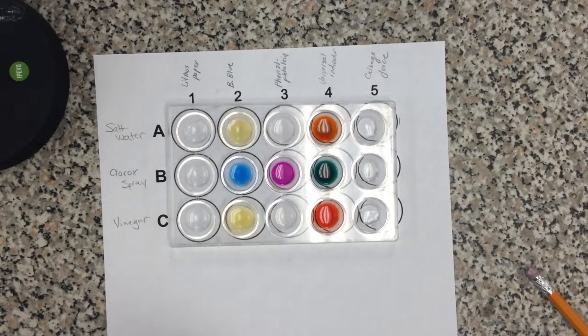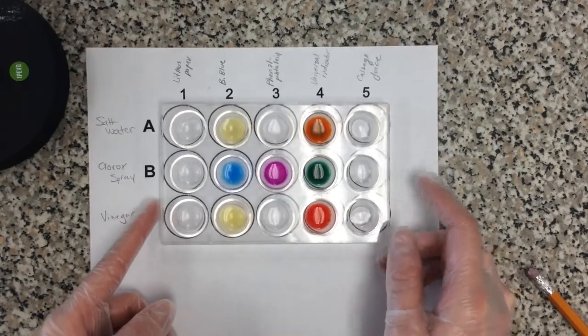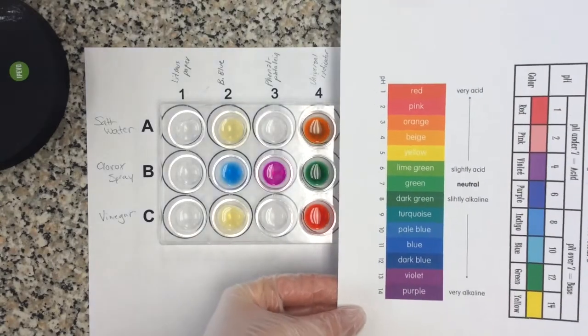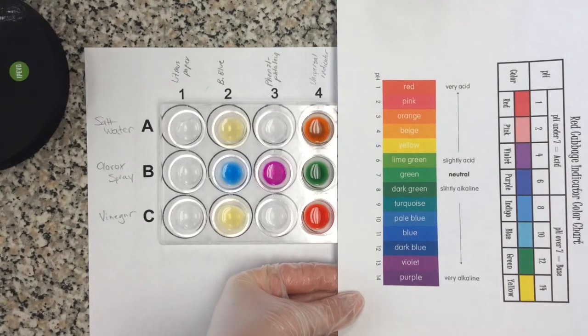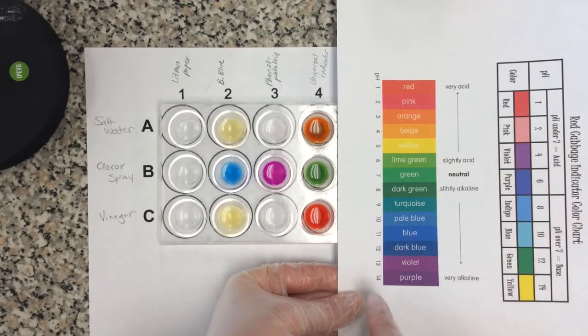All right. It's getting colorful. Okay, so this is where you'll use this chart. Okay, so you're going to try and match it up with the color that best suits it. And then you're going to tell me, okay, what's the number that matches it as well? So tell me the color and tell me the pH number.